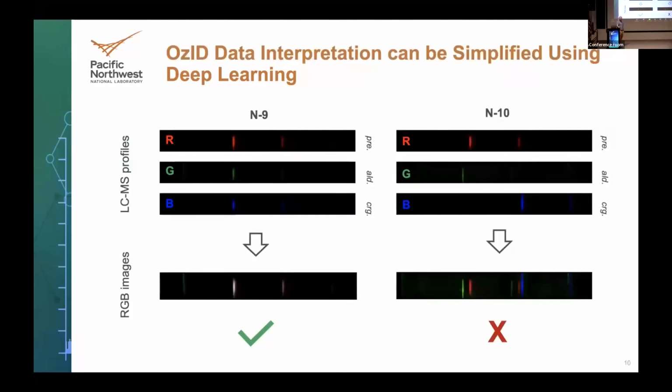That's an excellent question, and I probably could have made it a little more clear. I'm specifically using a deep learning architecture, a deep neural net. And the benefit, thanks to Ivet for spending some time to explain that, is that you don't necessarily need to do explicit feature engineering.